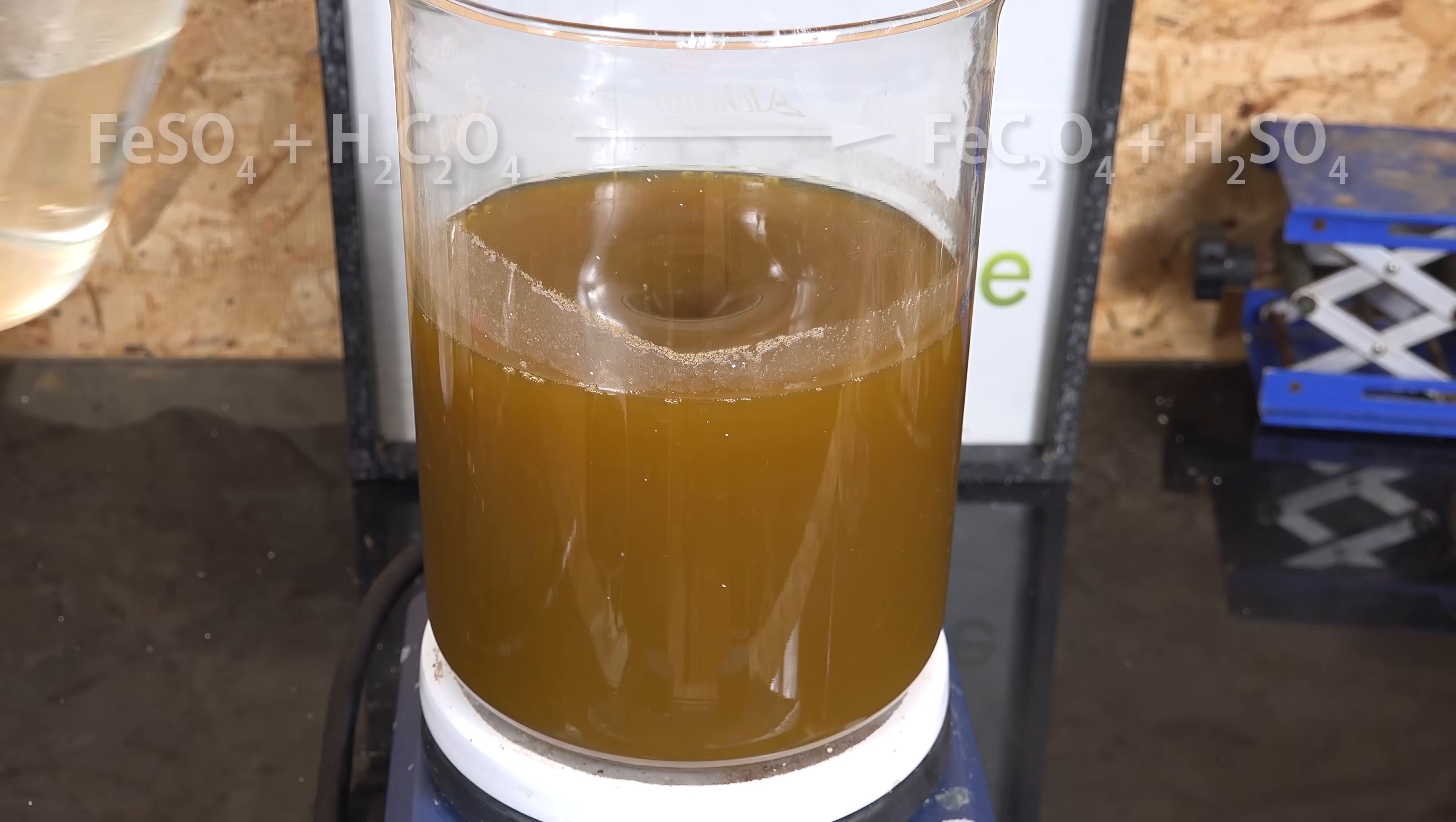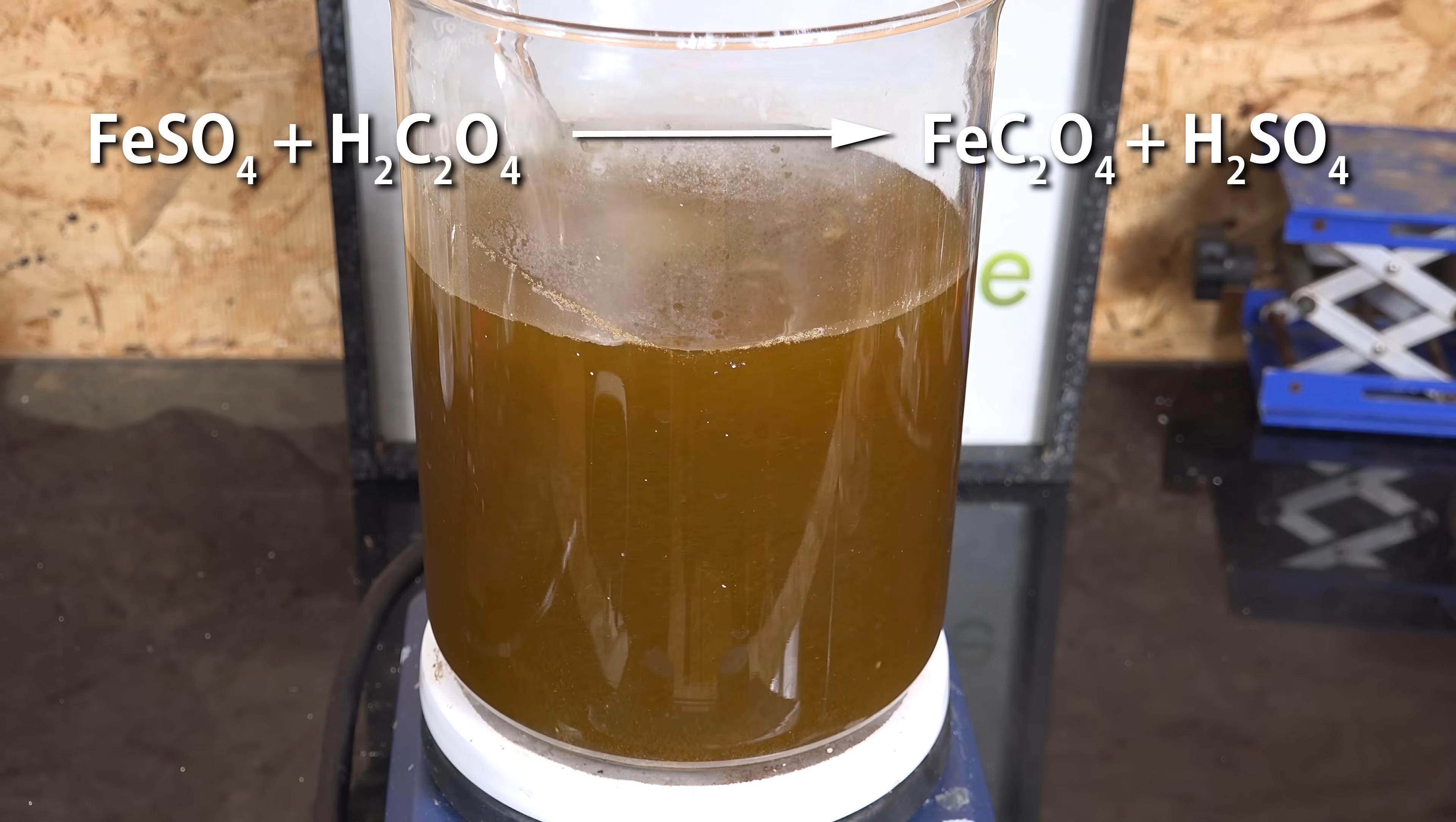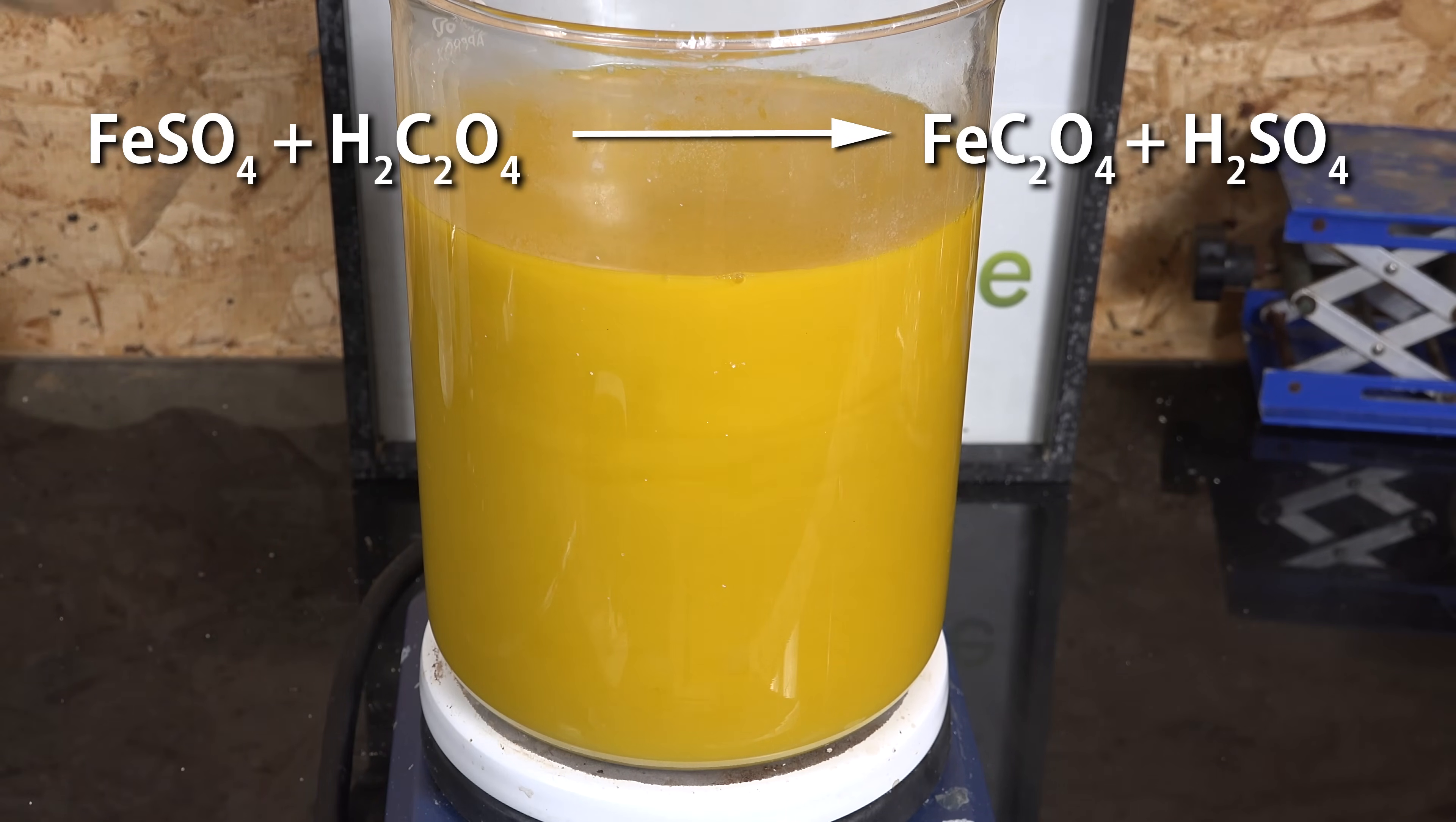Oxalic acid has the rather interesting property that forms insoluble oxalate solids with many metal ions. So if reacted with iron sulfate it will produce insoluble iron oxalate. The sulfate ion is freed and becomes sulfuric acid. This is a rather unusual reaction because usually the reverse reaction is more favorable.